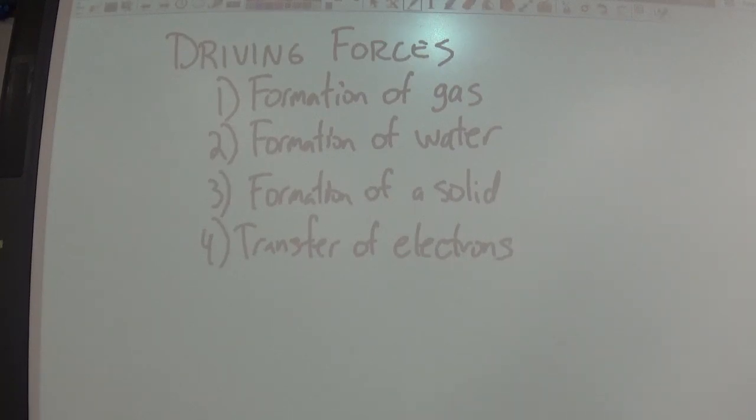For what we're doing in our class in general, we're going to be looking at the top 3 things. Do we ever see the solid forming? Do we ever see water forming? Do we ever see a gas forming? The lab that you're going to do today, or tomorrow, or whenever it is, I'm all mixed up. I don't know when this is.